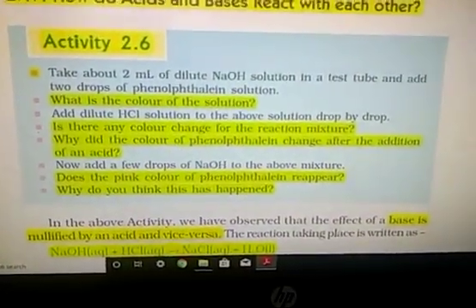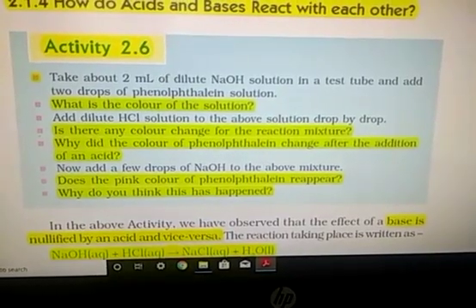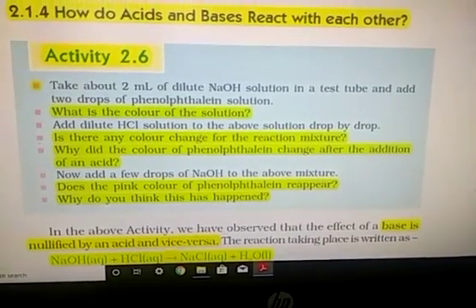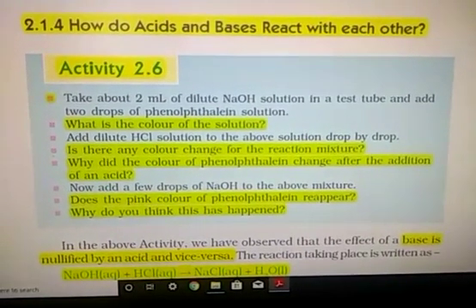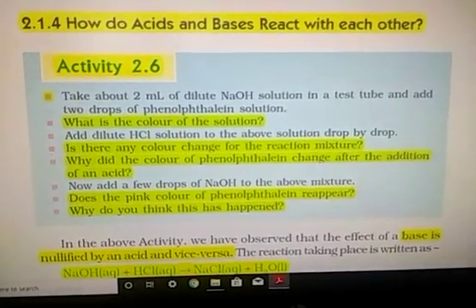Take 2 mL of dilute sodium hydroxide solution in a test tube and add few drops of phenolphthalein. As you already read, phenolphthalein gives pink color to sodium hydroxide solution. So whole solution becomes pink in color. What is the color of solution? Pink.